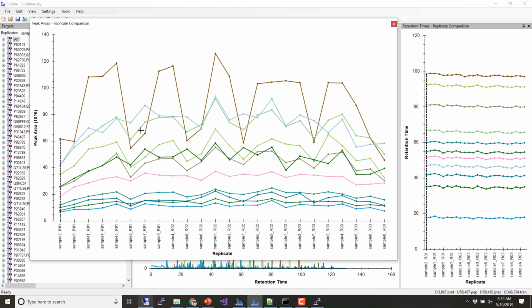We definitely see that if this was the only thing that was changing, well, really the job of the IRTs is really just to be stable on retention time. So they don't need to be totally stable, but we can certainly learn stuff from that. But yeah, so again, we saw this. So we're not seeing any sort of order pattern. The only interesting order thing that I see is here. I definitely get a nice feeling that, okay, they randomized.